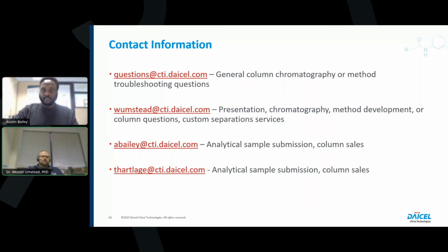Dipeptides, we have found that dipeptides work even up to tri and 6-mers on ZWIX, which is the zwitterionic amphoteric chiral phase. So it's possible that ZWIX might be a better option, but I would be interested in having you try our new column because I have a feeling that it could work quite well for what you're trying to do here. So I would encourage you to reach out to us so that we can give you some more information on how to get that.